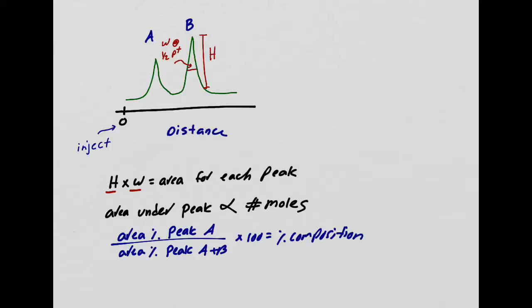So when you compare the peaks relative to each other, you can figure out the percentage of composition.